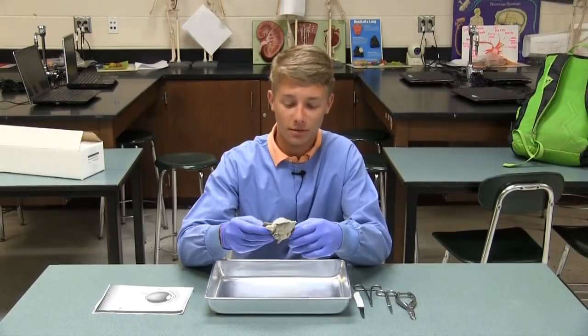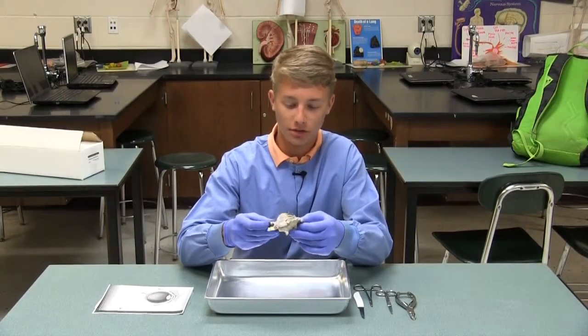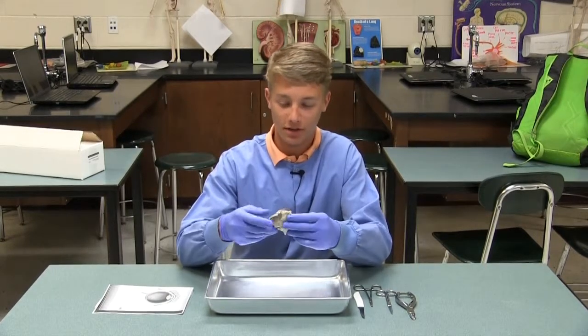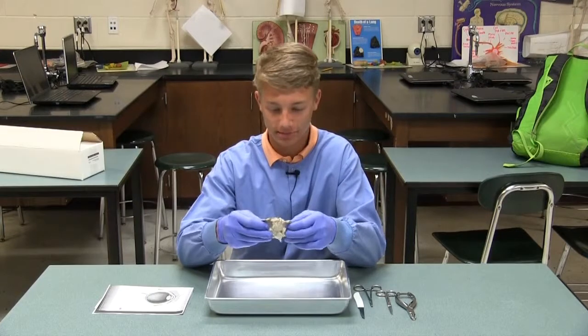My name is Cole Snyder and I'm going to be walking you through how to do a simple cow eye dissection, here in Ms. Gerald's class.